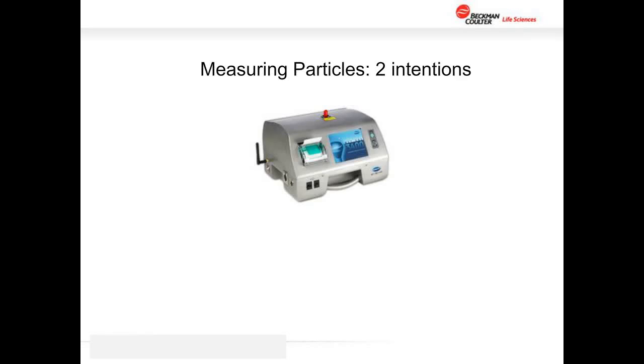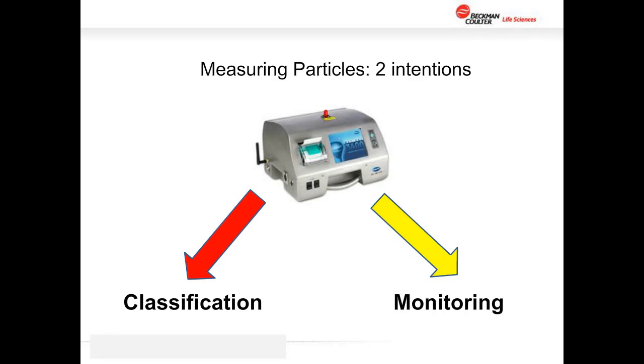One of the things that's very important to understand, and I hope everyone leaves this webinar with a clear understanding, is that even though we have instruments, particle counters, that are used throughout the applications here, there's really two fundamentally different philosophical uses for it. One of those is what we're focused on today, that is classification. The other is a monitoring application.